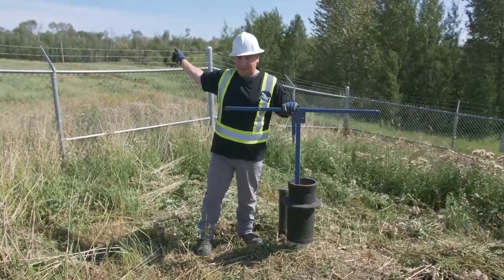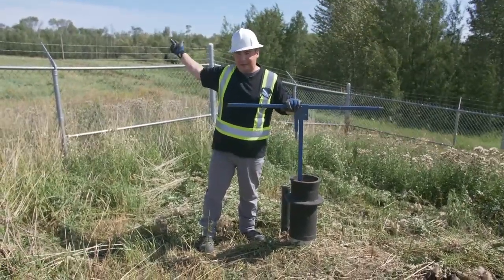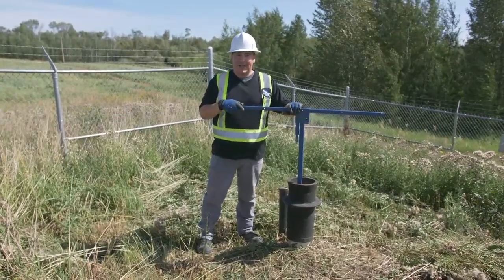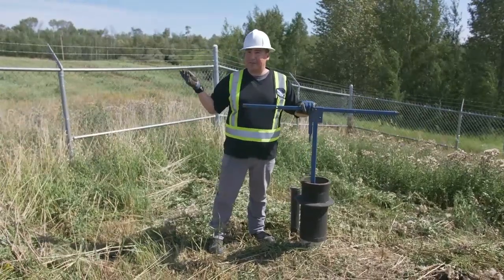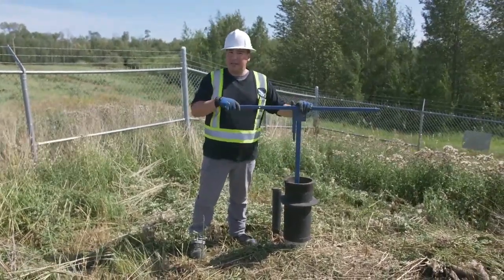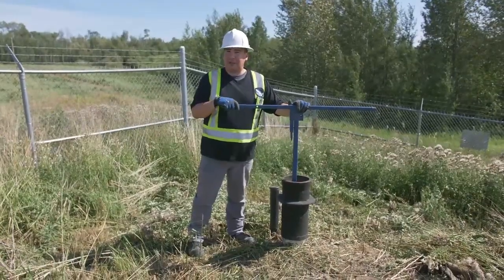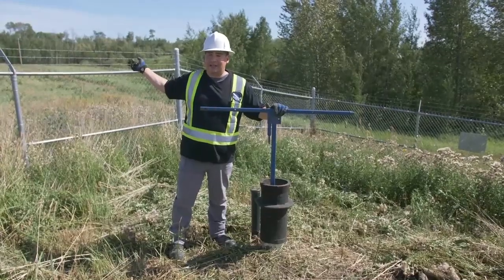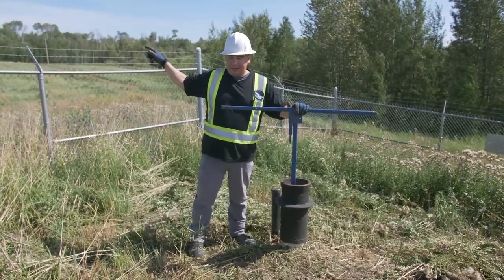Once we go collect the wastewater effluent sample, we'll come back and close this valve. Once those sample results come back and if they're good, we will come back, plan to open this, and drain as much storage as we can. At that time, we collect the second sample and send it into the lab.